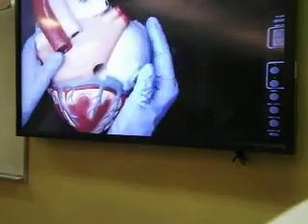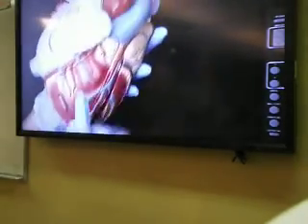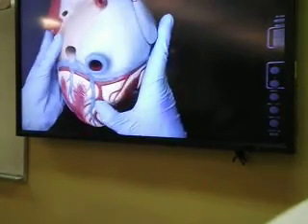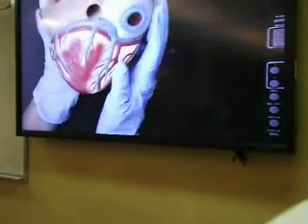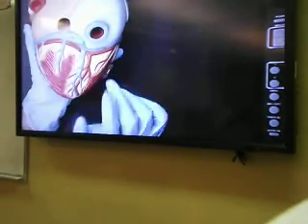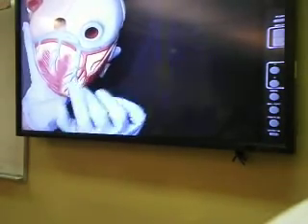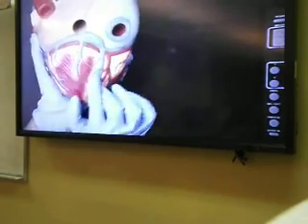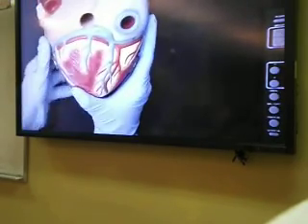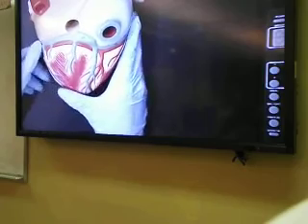Just like that, and this groove between the right atrium and right ventricle, where the right coronary artery is starting to become the posterior interventricular artery, that groove we call the coronary sulcus. Now, those are the two or three coronary arteries that you need to know supplying oxygen to the heart muscle. But coronary veins or cardiac veins could be many.